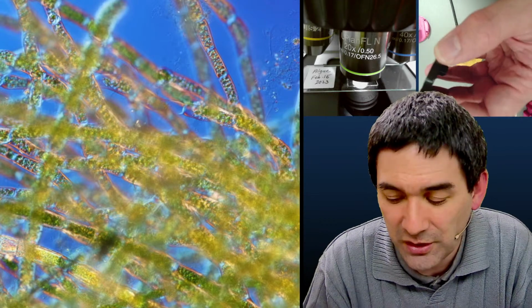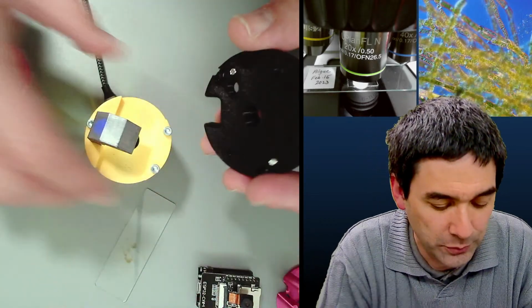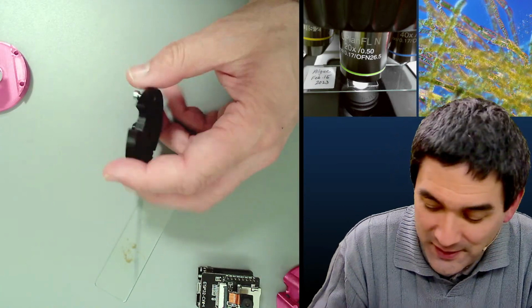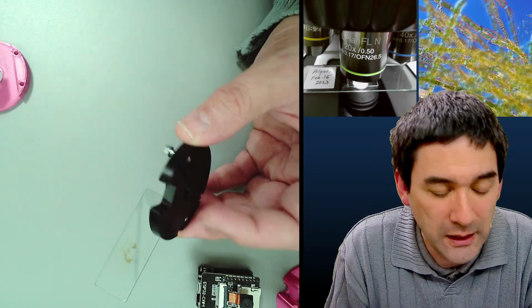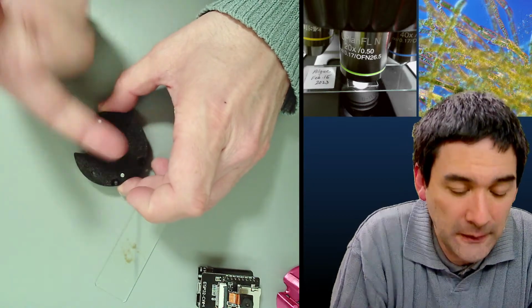I'm just going to use this here maybe. Of course, assuming that the mushroom is able to produce the spores. So if this would be the cap, this is the most improvised thing ever, right? And if this is the stalk of the mushroom, you've got the mushroom growing here, okay? So you take off the stalk, and you put the mushroom on a piece of paper and then you kind of knock against it.